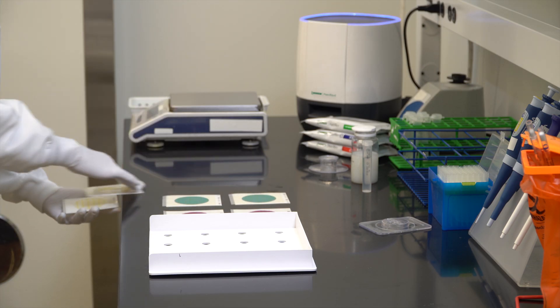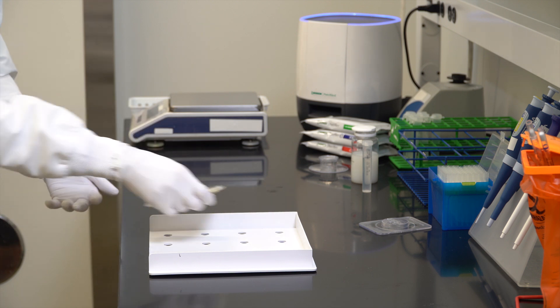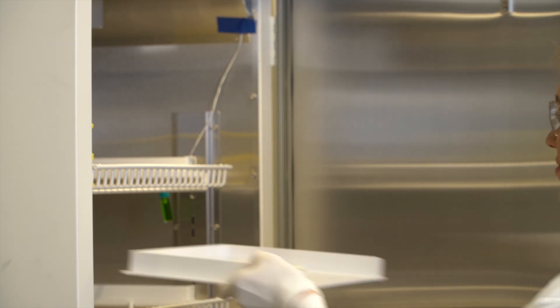Once the gel has formed, stack plates with the clear side up. Follow the Neogen Petri Foam product instructions for recommended stack height and incubation conditions.